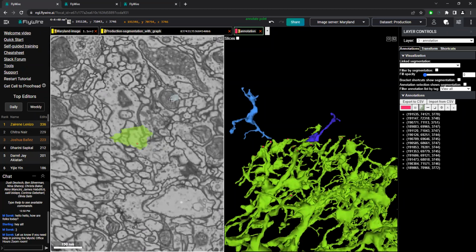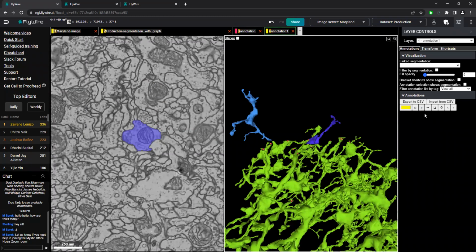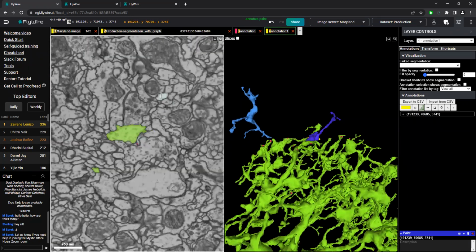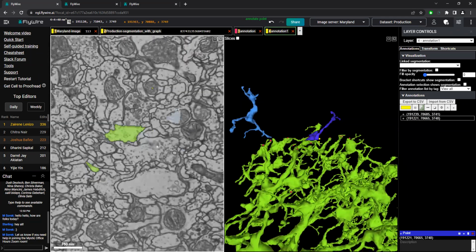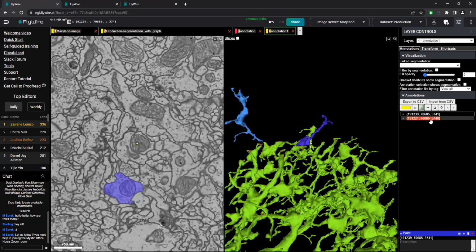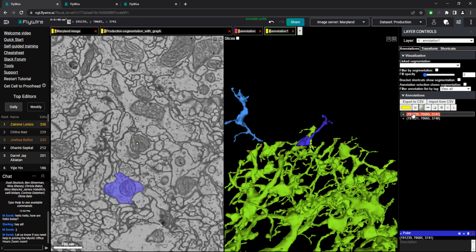The other thing too is we can look and say, all right, is it relative that this larger mitochondria or ER up here is also up here compared to this? So there's a lot of marking that you can do, and you can drop annotation points in different colors. Maybe we could create another layer and say, all right, we know this guy is up here, and in this one, it's this one where we started, and we could just click between and see that they're relative to each other. And that helps to see the picture of what's happening. So this big one here is shrinking when we go to the next slide.